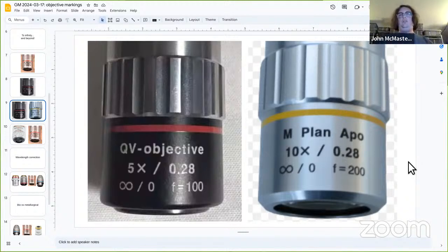But if in that initial step you didn't collect an image that had the fine detail you were looking for, you can continue to amplify that image and make it bigger, more magnification, but it won't have resolution. And that's where we have to be a little bit tricky as you go to higher magnifications: are you actually getting resolution with those magnification increases?